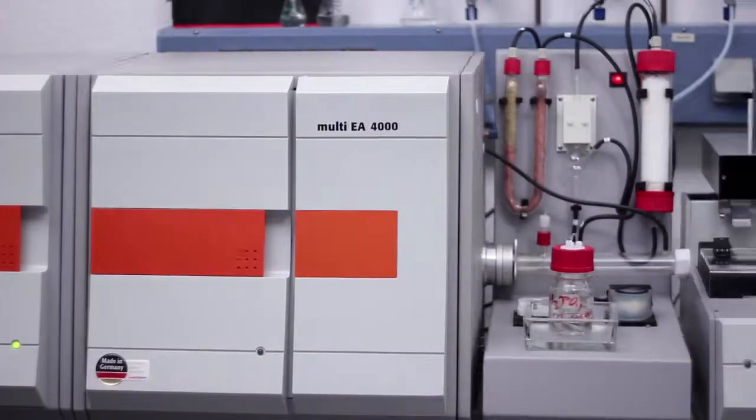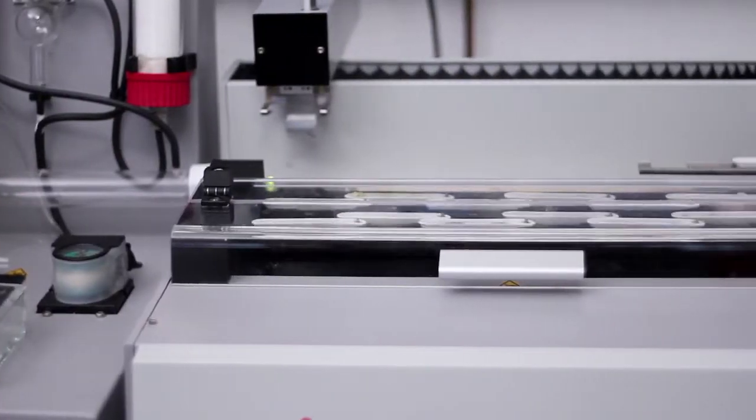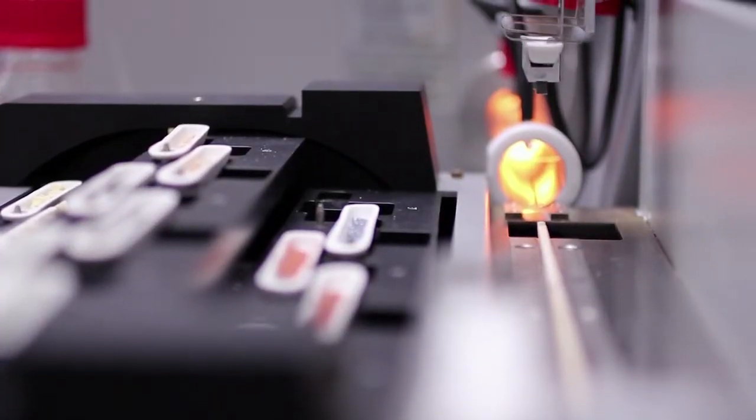The real macroelemental analyzer multi EA 4000 convinces its users by robustness, high sample weights and automation flexibility. Carbon, sulfur and chlorine are easily analyzed in most diverse matrices like soil, waste or coal.